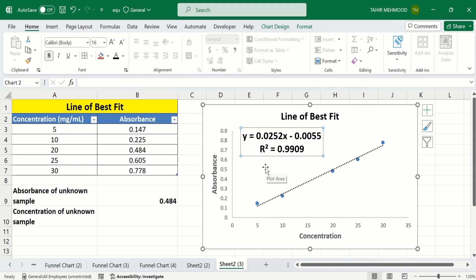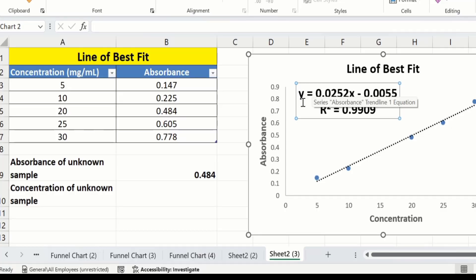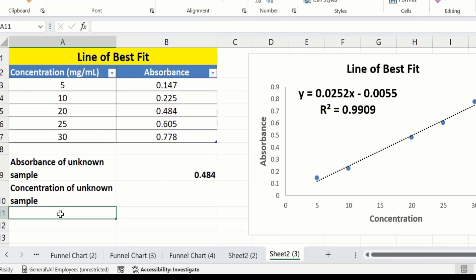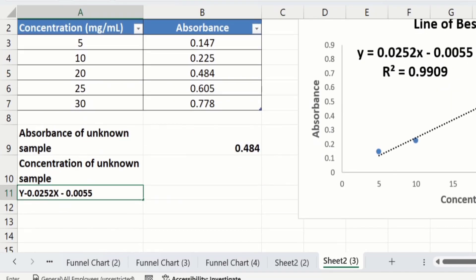Currently you can see I have the absorbance value of the unknown sample, which is 0.484. Now I will write the regression equation, which is: y = 0.0252x minus 0.005.